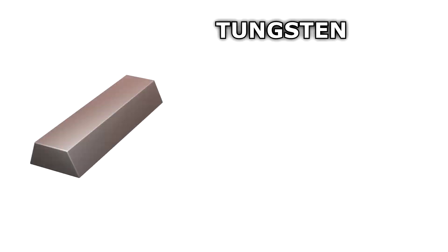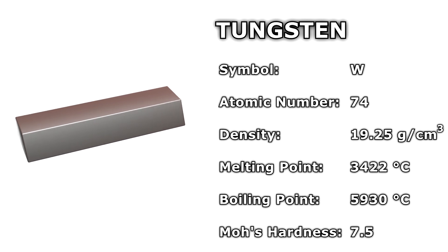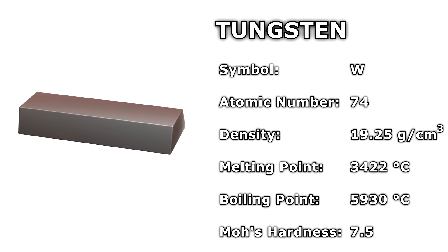...which makes sense, as this material has an incredibly high melting point of 3422 degrees Celsius, and a relatively high Mohs hardness of 7.5.